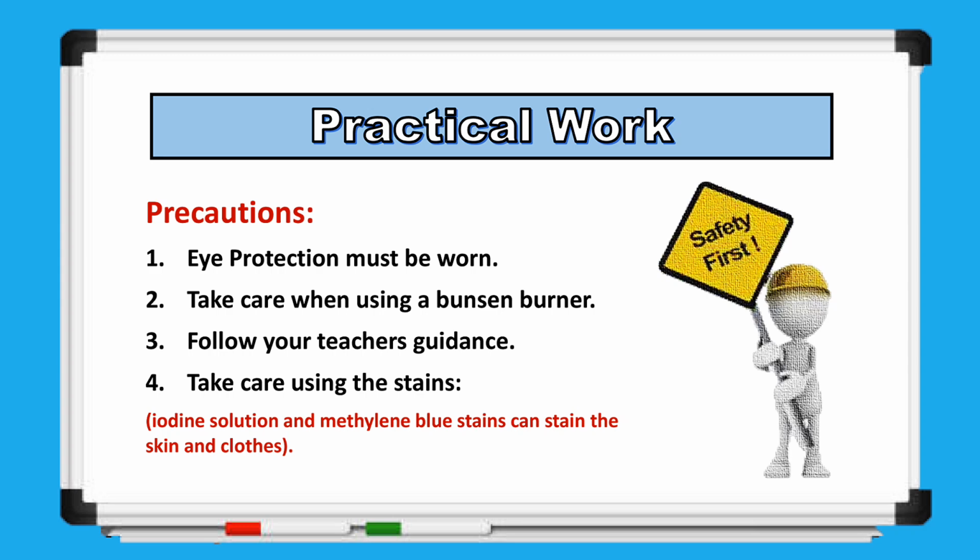Before we get into the practical experiments, it's important to remember that safety in the lab is absolutely essential. No matter how simple the activity may seem, safety measures should never be ignored. They help protect you and everyone around you from accidents or harm. For these particular investigations, there are a few key precautions you must follow.